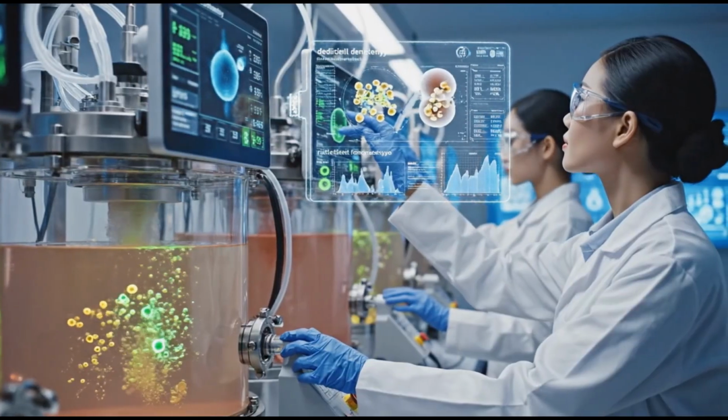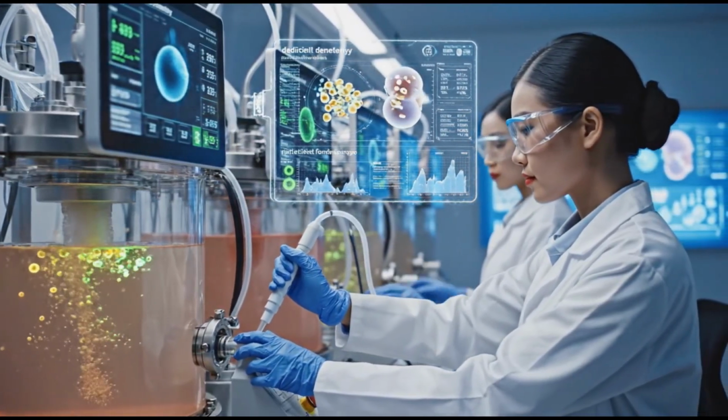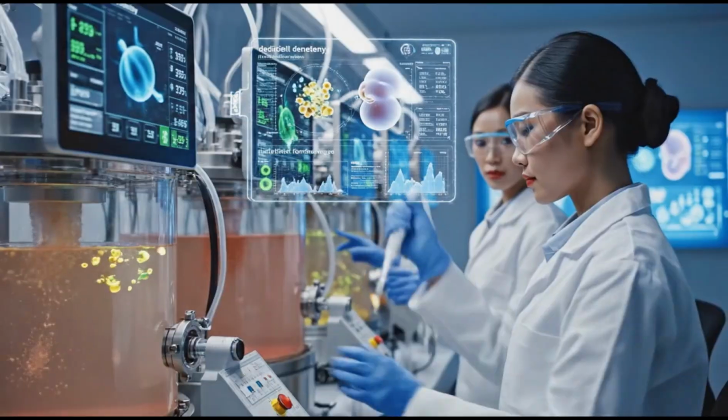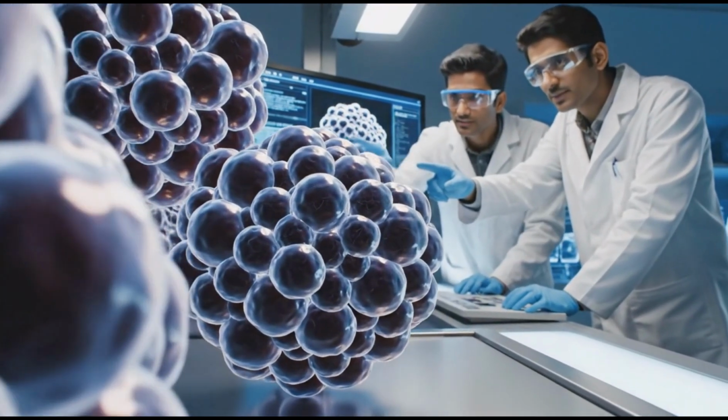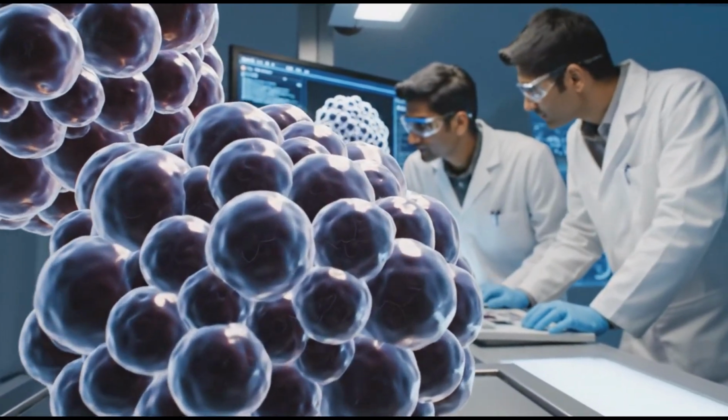Fat cells multiply steadily inside dedicated reactors, and the nutrient balance encourages rich lipid formation. Look at the density here. Yes, the lipid accumulation is significant. This batch shows great potential.